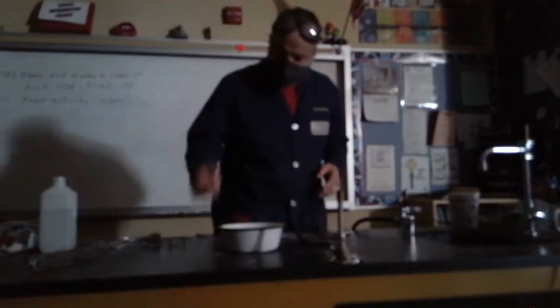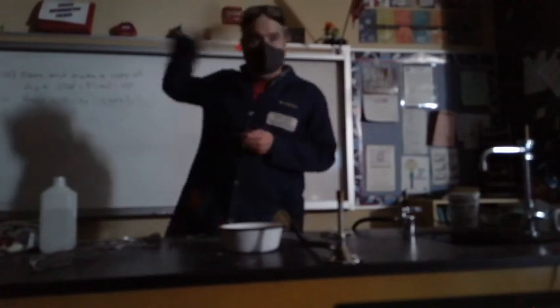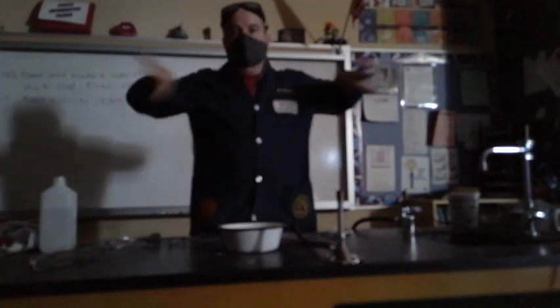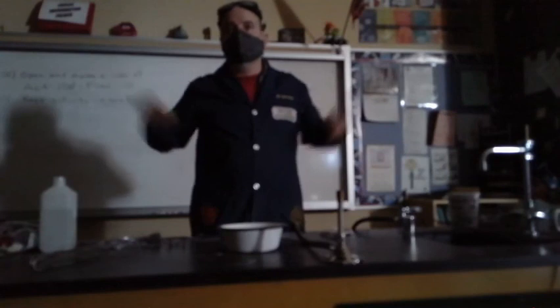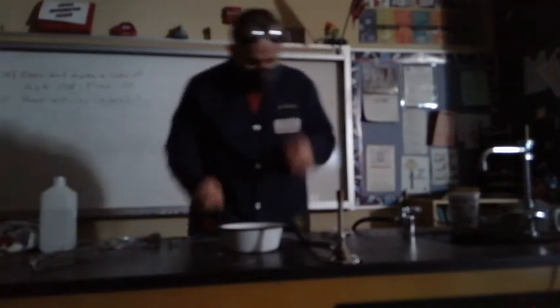I have here a little piece of metal. It's magnesium, number 12 on the periodic table. And if you notice, it's on the outside of the periodic table. If you remember from first quarter, things on the outside of the periodic table tend to be more reactive than the things in the middle, right? Now, I'm going to light my lab burner. Gas to go through the tube.